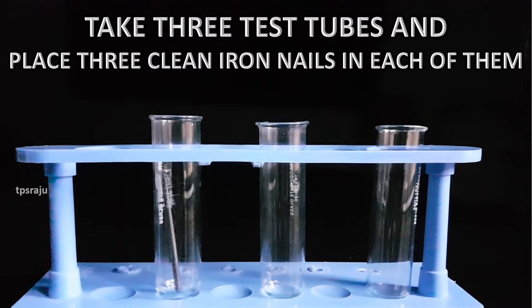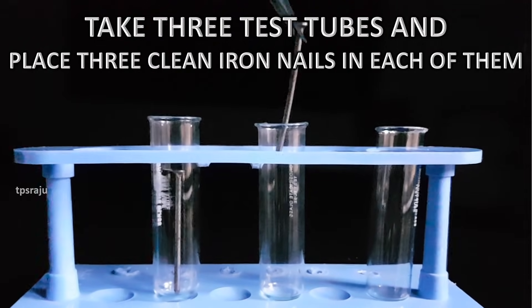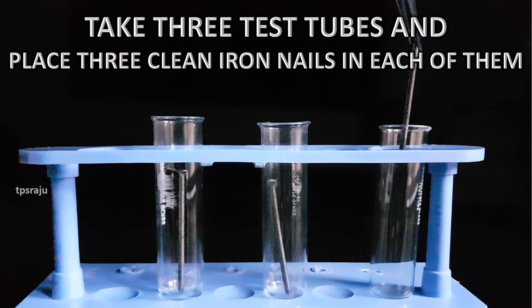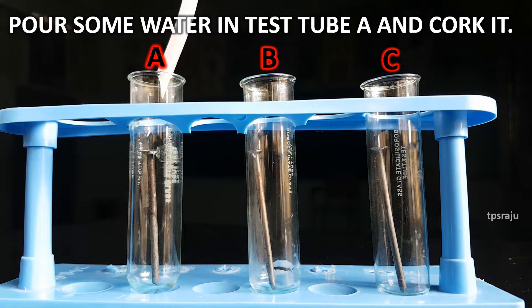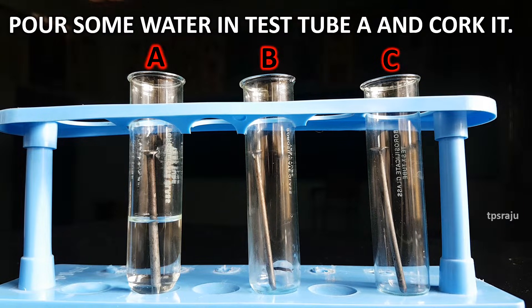Take 3 test tubes and place 3 clean iron nails in each of them and label these test tubes A, B, and C. Pour some water in test tube A and cork it.